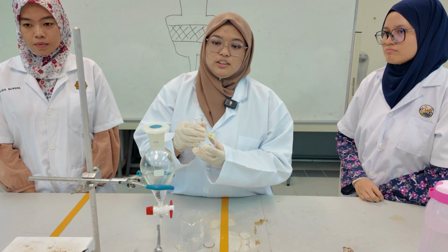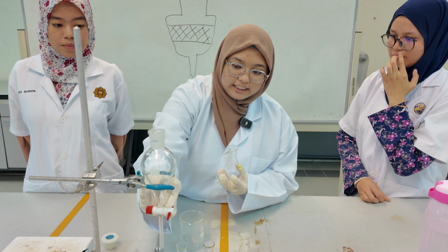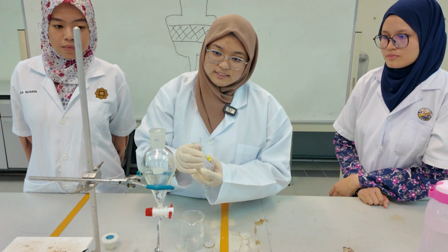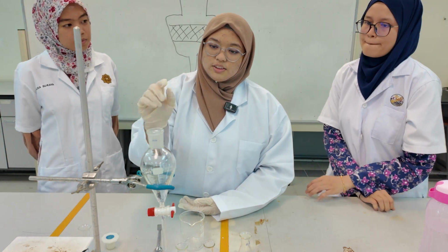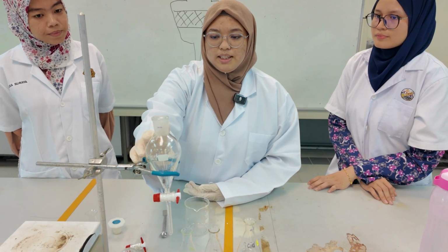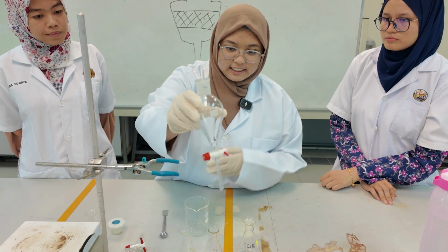The mixture will be put inside this separatory funnel. Make sure that the funnel is fully closed to prevent any dripping. So this will go into the funnel, and to this we will add 10 milliliters of 5% sodium hydroxide.